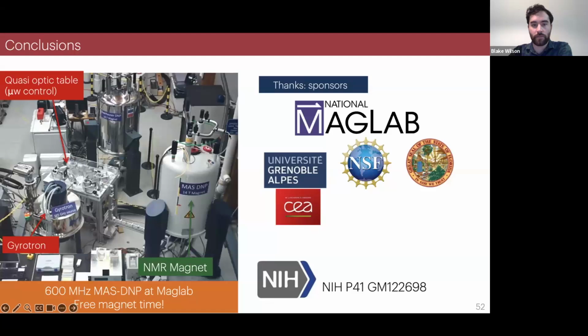Great. I have a question from Alexandre. You mentioned that the enhancement is not exactly how much we gain, but that it depends on the temperature, so this is the ratio you're talking about. Is it possible to correct and calculate the exact gain we have with MAS-DNP?